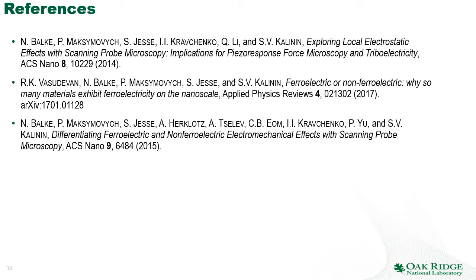If you are interested, you can find more information about CKPFM in the following publications, starting from Nina Balke's paper of 2014 and continuing to 2015 and the recent review paper that illustrates the CKPFM applications for ferroelectrics.